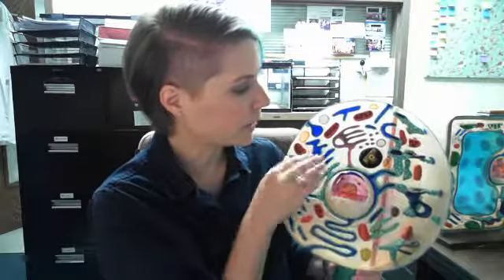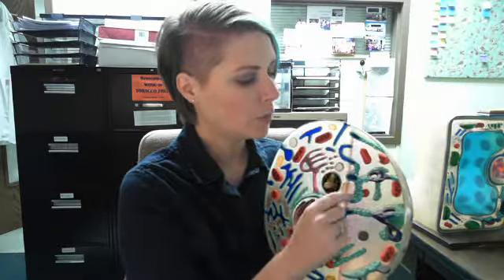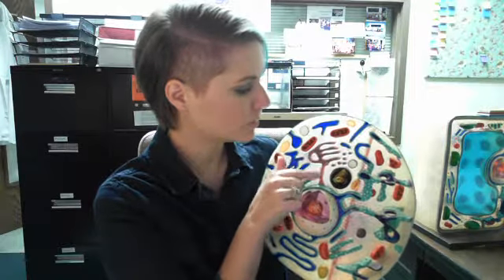All of this, that green and blue, is going to be endoplasmic reticulum. I don't normally distinguish between the rough and the smooth ER, but just in case, the areas where it's showing just the blue would be smooth ER, but where it has the white dots on it, that's going to be the rough ER. This right here is going to be the Golgi that has little vesicles.